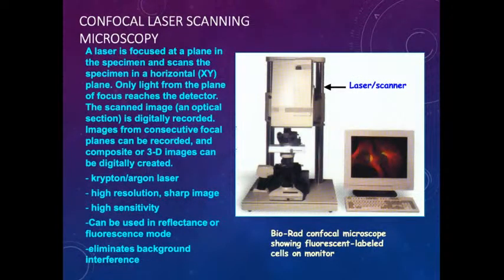Then comes your main confocal laser scanning microscope. The image that I'm showing is pretty old, but now very advanced versions are in the labs, and they are quite expensive. We can't even think of it in our minds. They are pretty expensive, but whoever has these facilities can do really good science with that. You can have really good 3D images. Even I got some in my PhD.